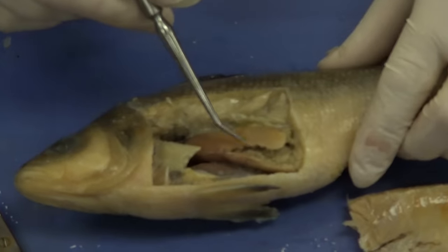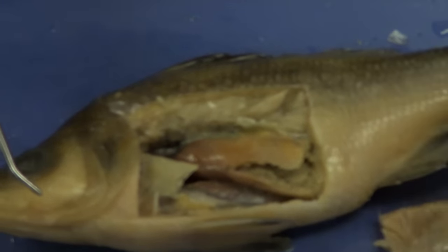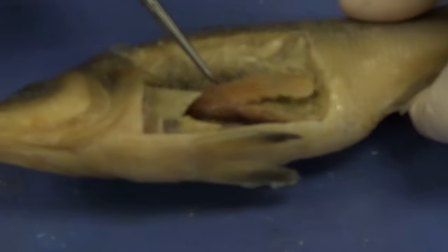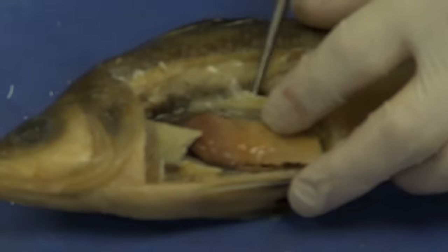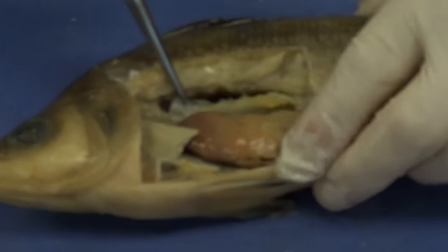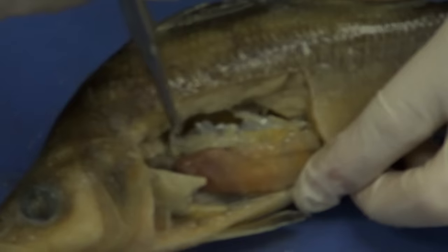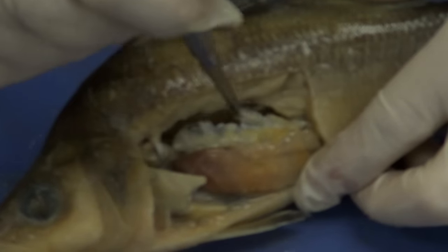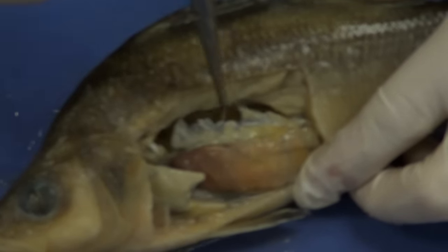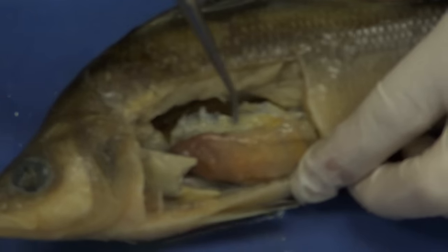And there we go — I've removed the outer wall of the fish. Let's go ahead and identify some of the organs. Right here you can see the swim bladder — it's like a balloon. I'm going to lift this up a little bit. It's this balloon structure in here. The swim bladder is actually used for buoyancy; the fish will inflate or deflate it depending on whether it wants to go up or down in the water column.